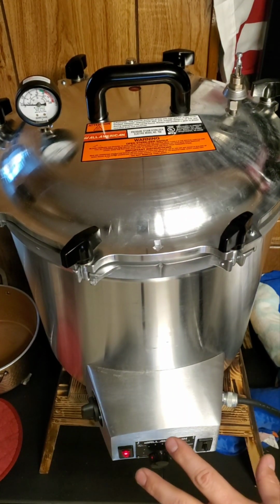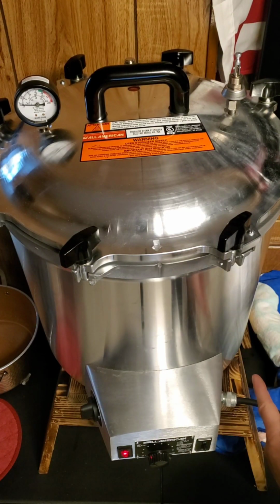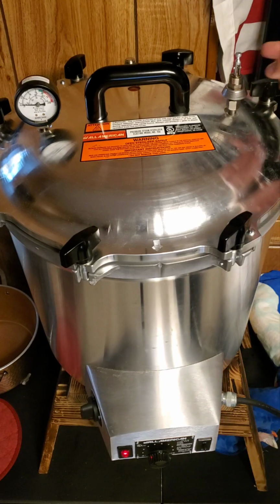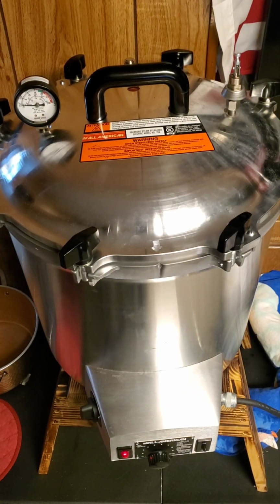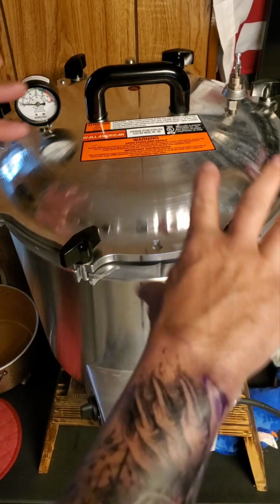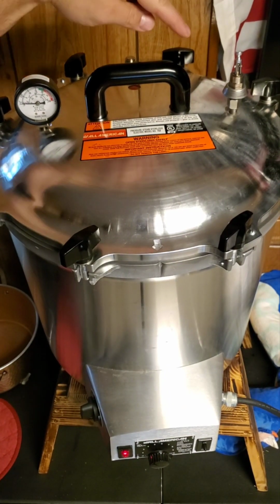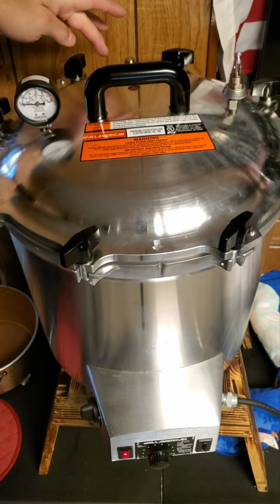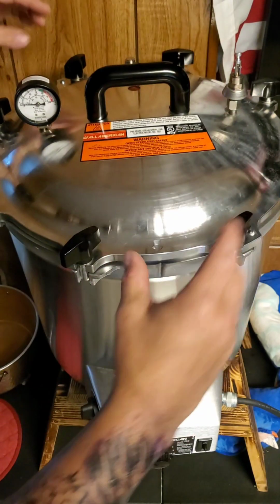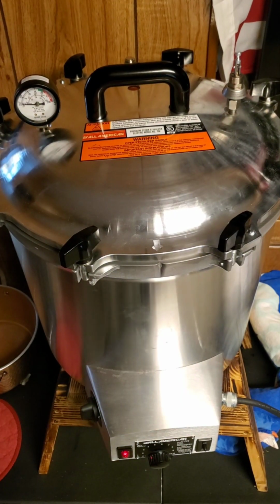You don't want to mess it up, but the water's already hot. You can hear it kicking on. Hear that heating element getting heat. This is open. And it's free of blockages. And that plate in there keeps the bags from blocking the overpressures, right? So that way, if something crazy does happen here, you still have your overpressures to protect you. So that's what the plate's really doing, is keeping the bags out of those. And yeah. So I'll turn this camera back on once we get some steam going.